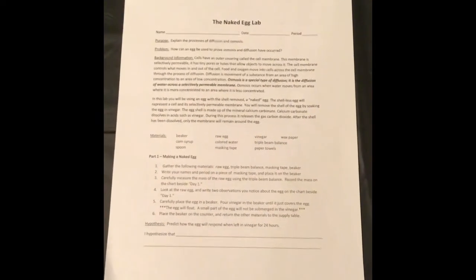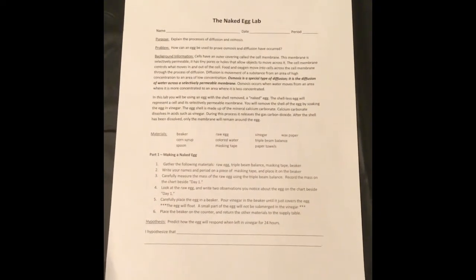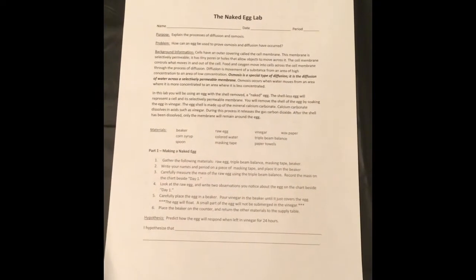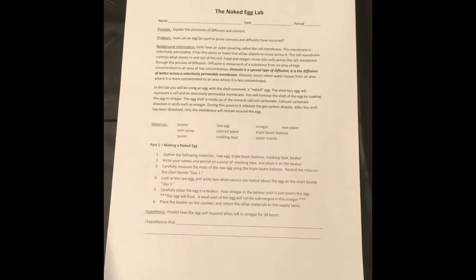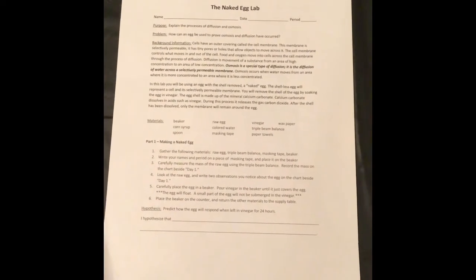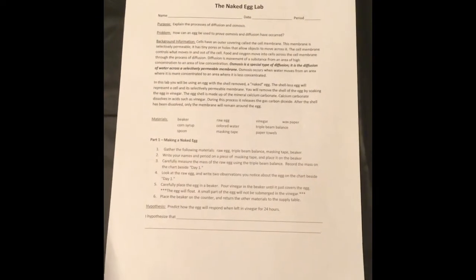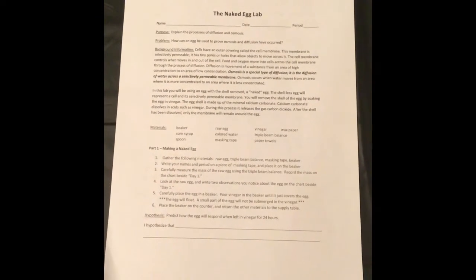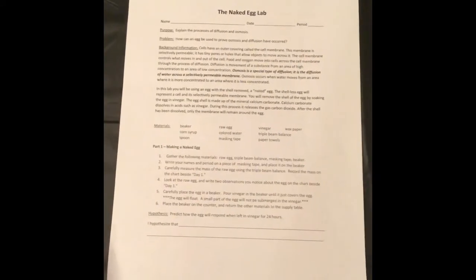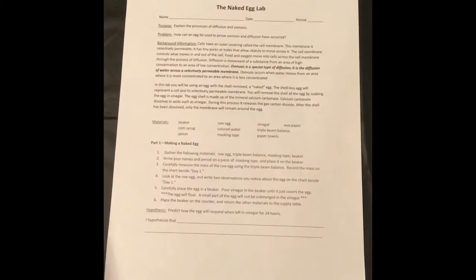The lab is called the Naked Egg Lab, and the purpose is to explain the processes of diffusion and osmosis. So I'm going to briefly explain what we'll do throughout the entire experiment. This is a multi-day experiment, so I'm going to go through each part, and then I'll conduct part one. There'll be additional video clips that explain each of the additional parts.